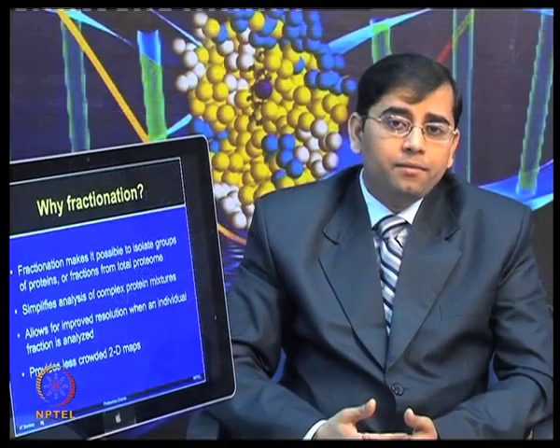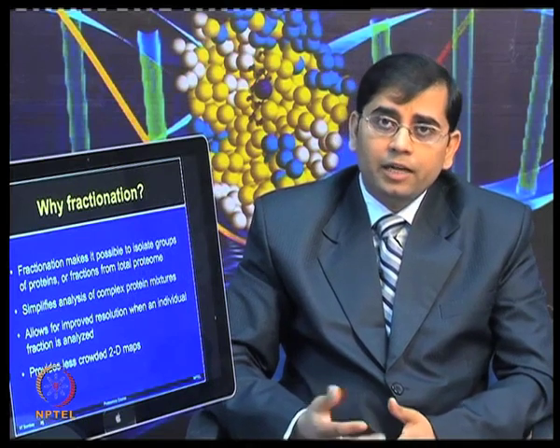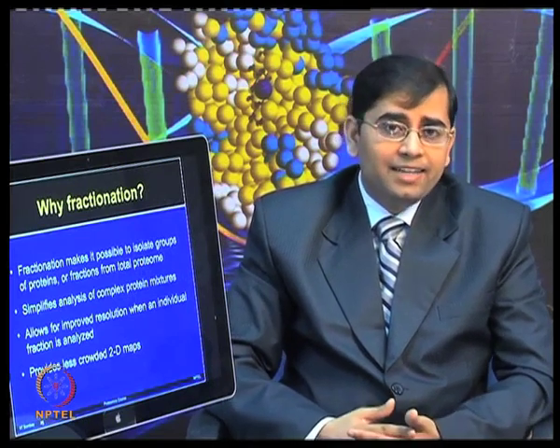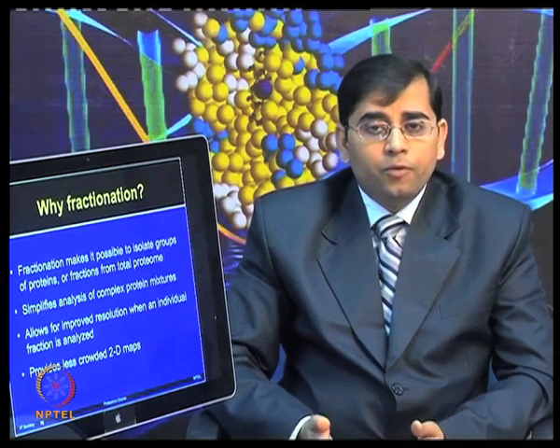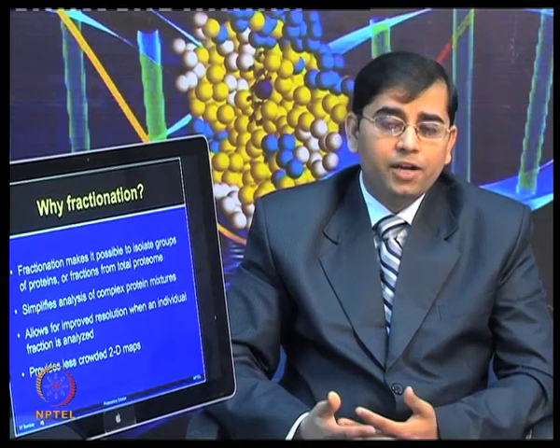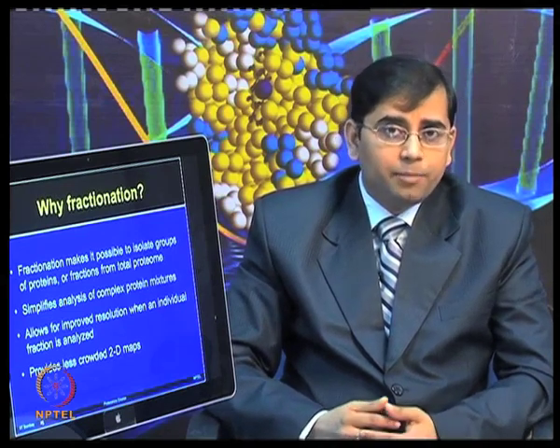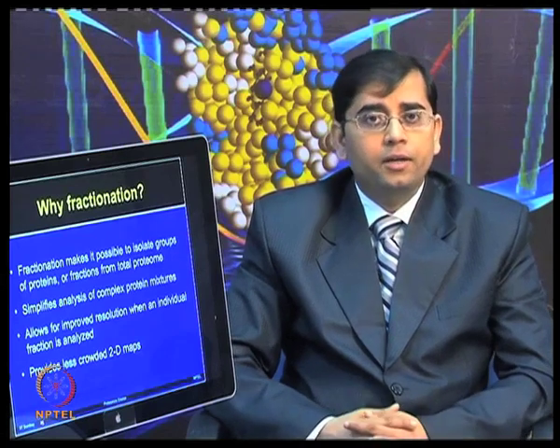When you apply your protein samples on a 2D gel or other gel-based proteomic techniques, this will provide you a less crowded protein map. So, fractionation serves a good need in both gel-based and gel-free proteomic applications. Let us talk about the different fractionation methods available.